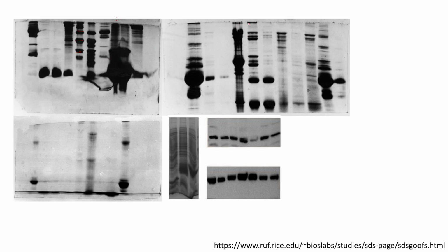Same thing has happened here. If you see this lane, you can see separate, straight bands. But in this lane, since an excess amount of sample has been loaded, you can see streaking of the sample, right? The sample is kind of smeared over the gel. So this is a very bad loading of gel. All these pictures that you see are examples of defects that arise during SDS-PAGE analysis.